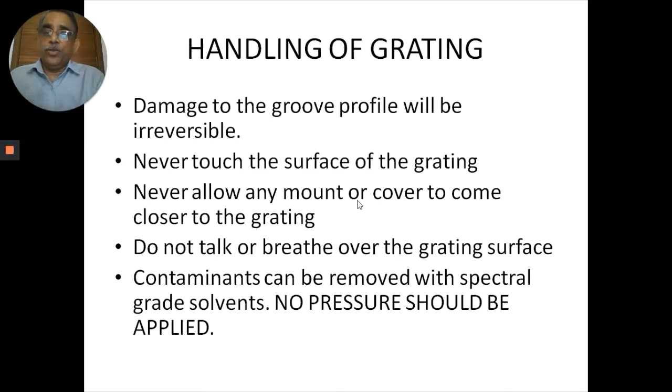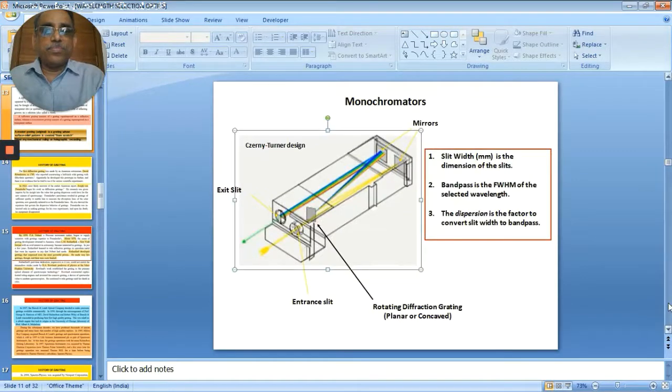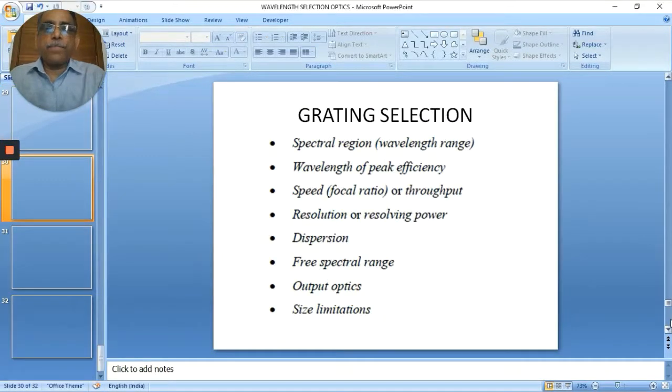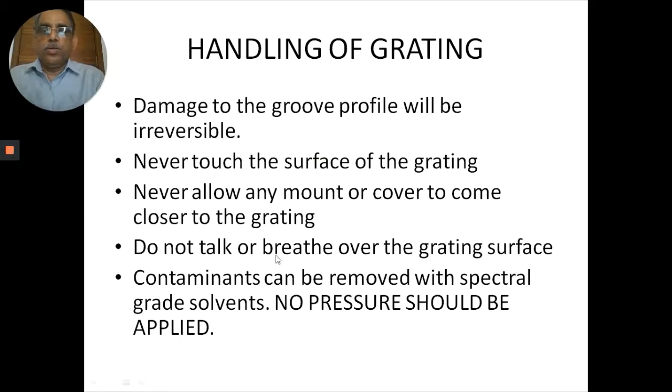And not only that, you should not even talk or breathe before the grating surface. This is very important.